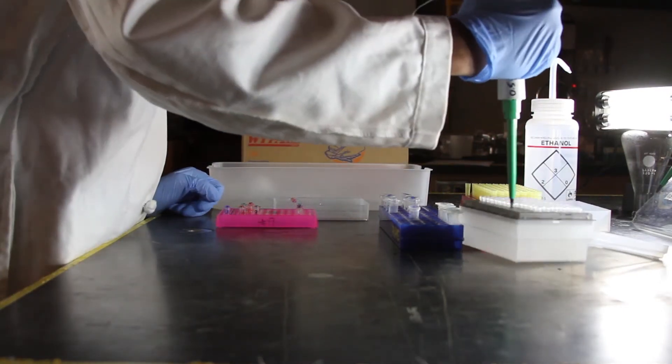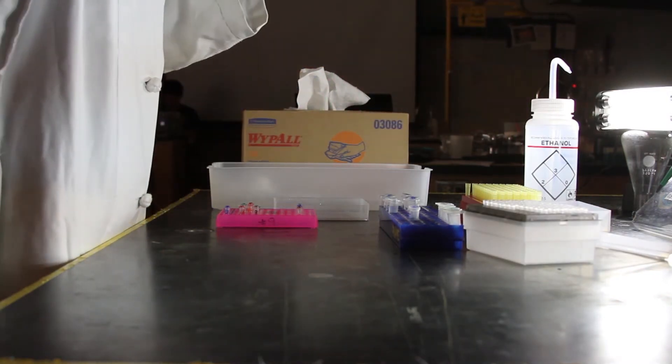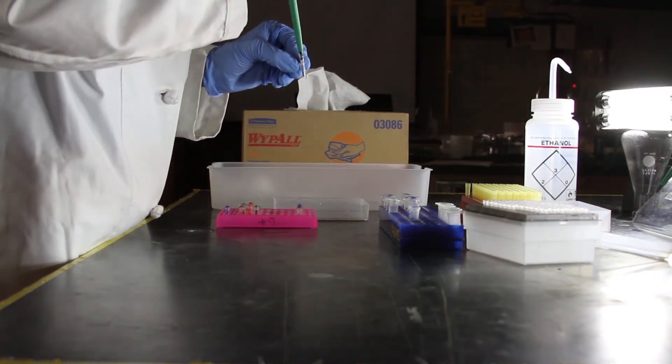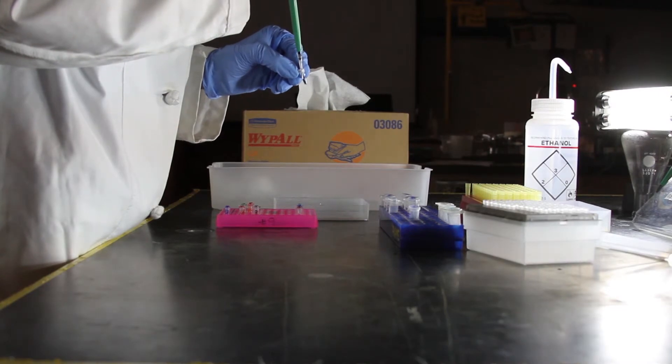The total volume in each tube should be approximately 50 microliters. Mix well by pipetting slowly up and down 5 times. Be gentle and do not vortex.